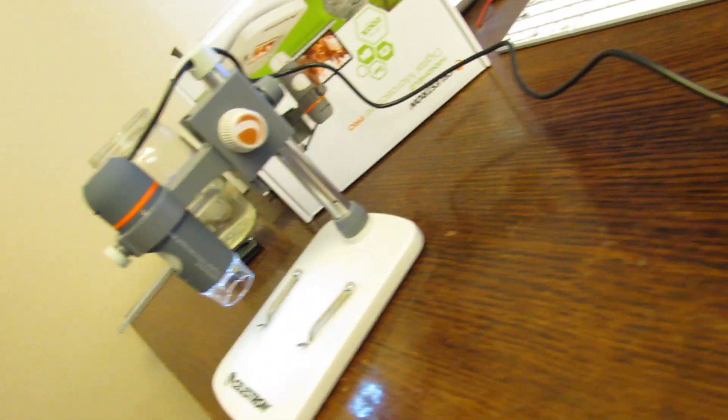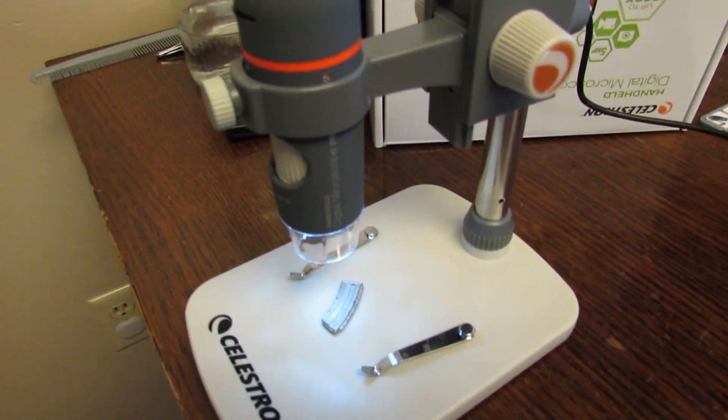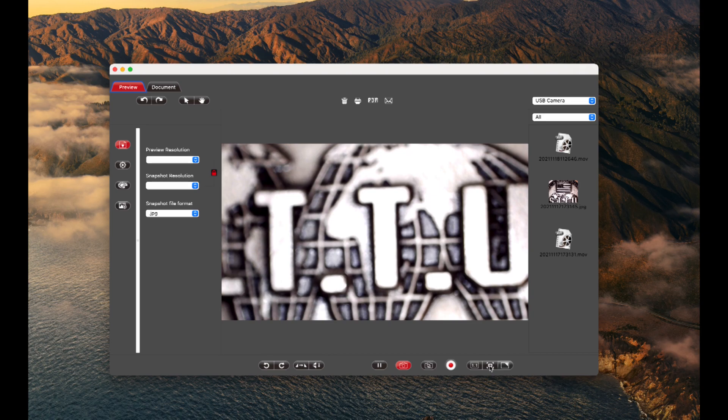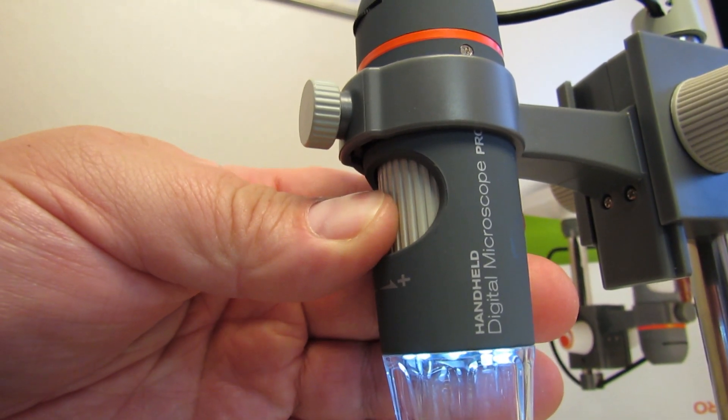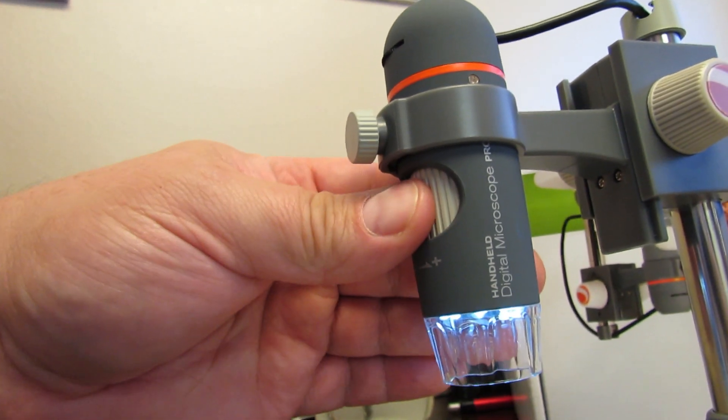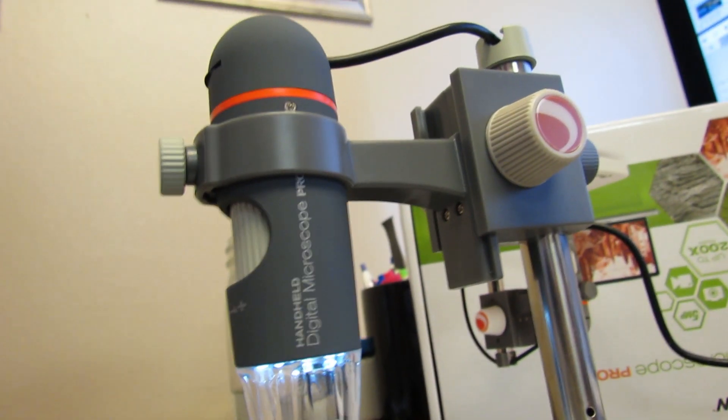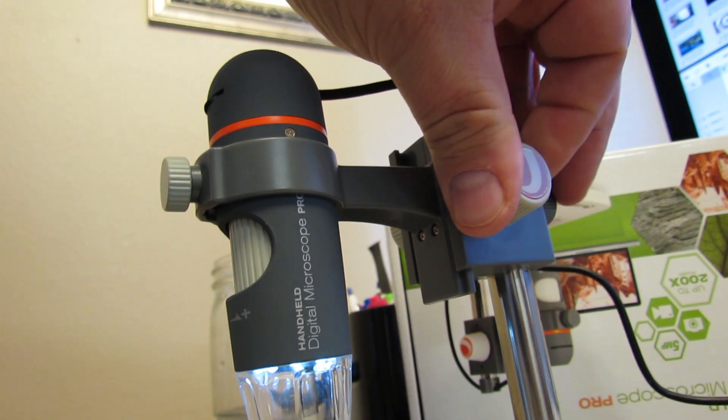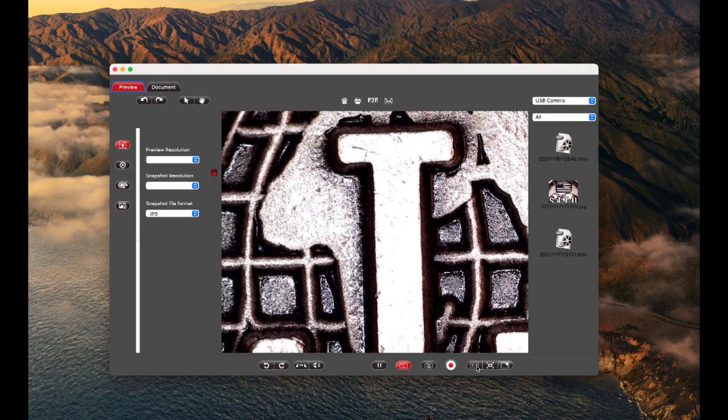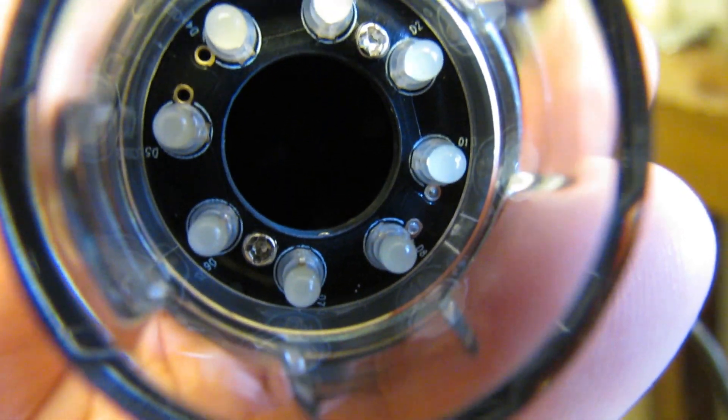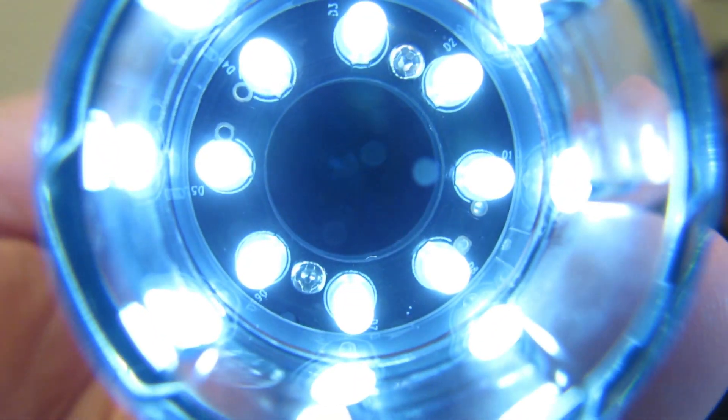It's nice to be able to zoom in and do macro photography of small objects and get good clear pictures. A lot of the displays and lessons require this to explain how stuff works. This is a digital microscope and it's relatively affordable, like $130 or $150, maybe a little less than that. Very easy to set up - you just attach the post to the base and put the handheld microscope into the mount and plug it in with the USB port.